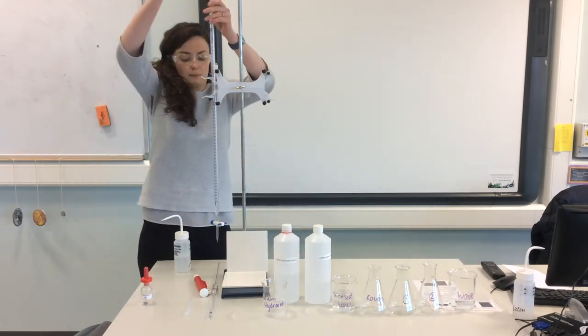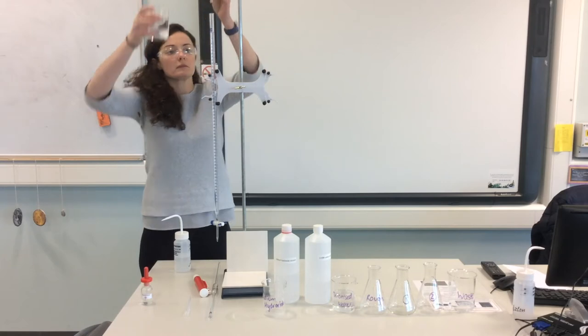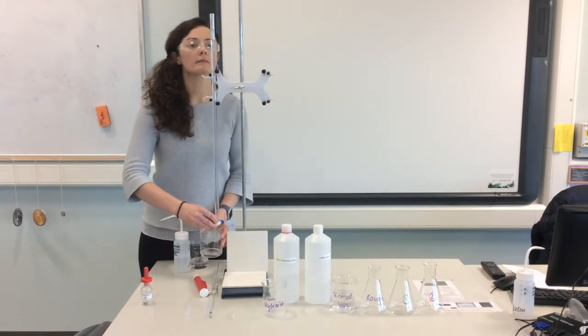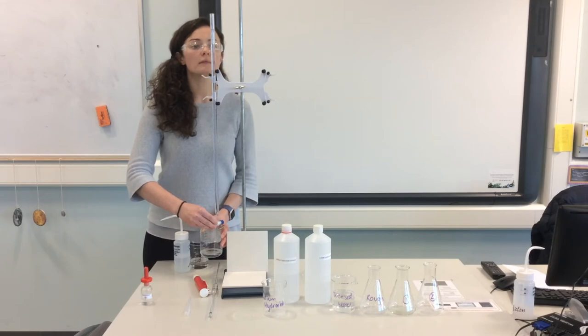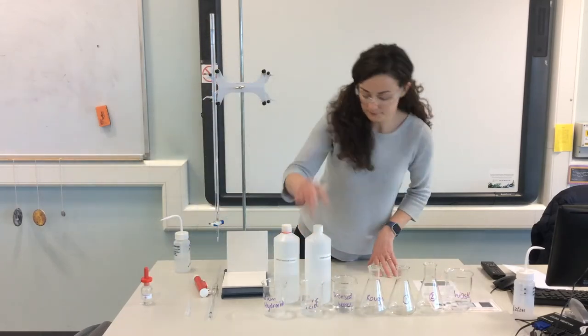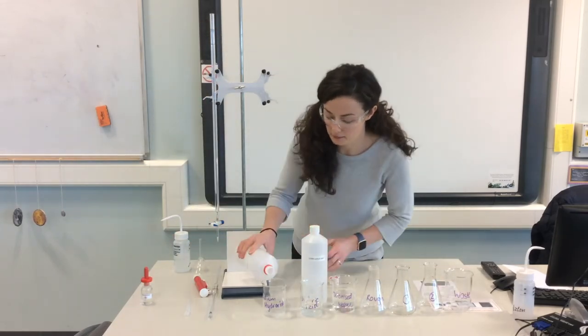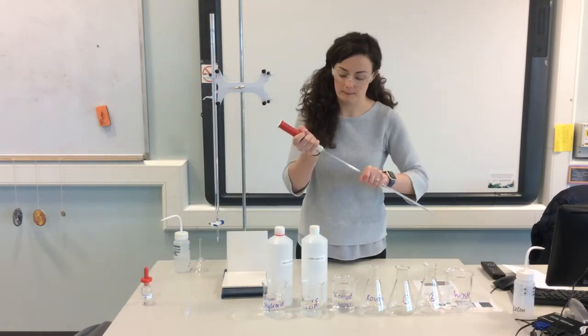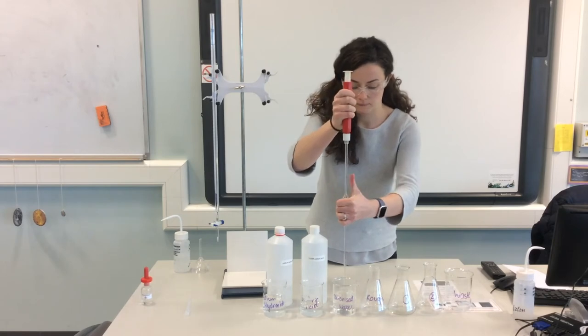I'm now filling the burette with my standard solution, that's sulfuric acid, so you overfill it and then make sure you fill the jet by opening the tap and release that until the level is zero, the bottom of the meniscus is at zero.